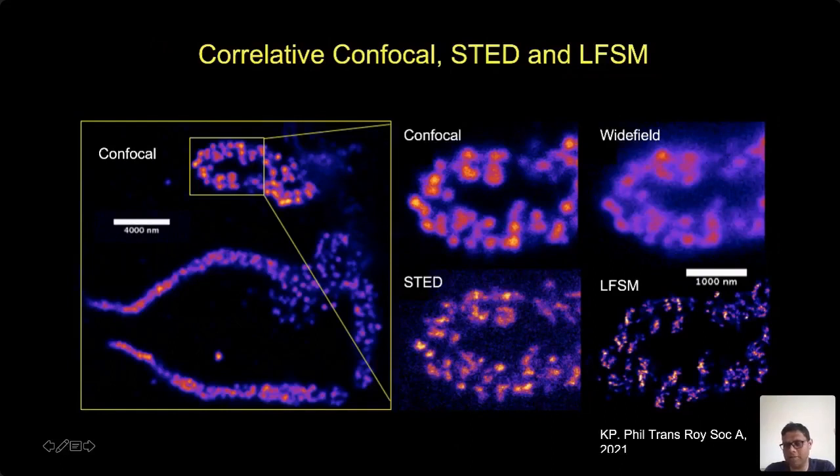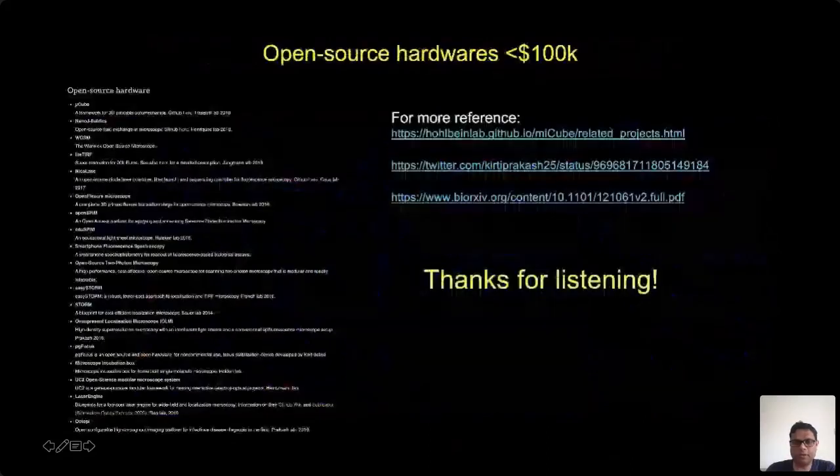I won't go into the biology, but with this laser-free super resolution, you can even resolve what you can't typically resolve with STED. Another thing is a disclaimer, I'm not really a STED expert, so you might get better images, but I think these are comparable with published images on lampbrush chromosomes.